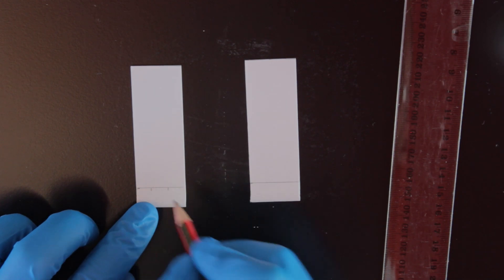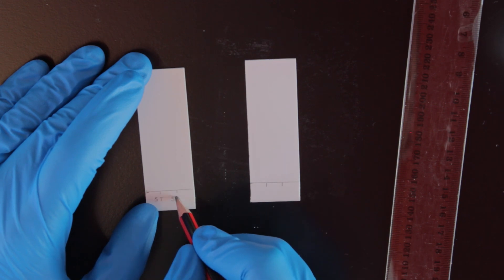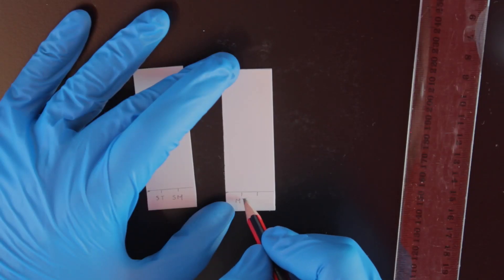Mark and label two positions along each line to spot your samples on. We've labelled the standard solutions as ST and SM and our product samples as MT and MM.